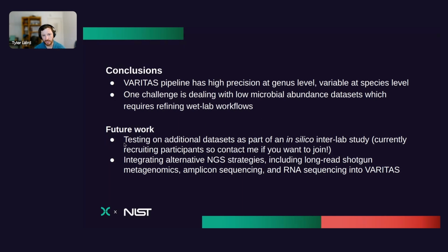So future work for the VARITAS database and pipeline, we are testing additional data sets as part of an in silico interlab study. NIST, which I work for, does a lot of these interlab studies where we compare pipelines and workflows from various labs, and we're currently recruiting participants.